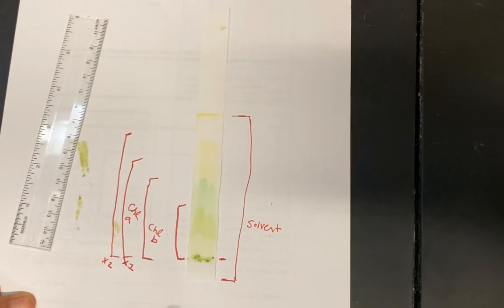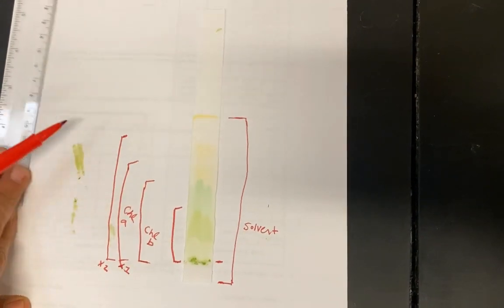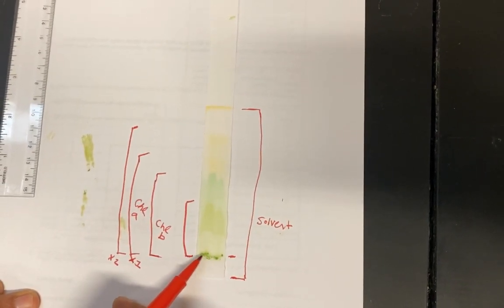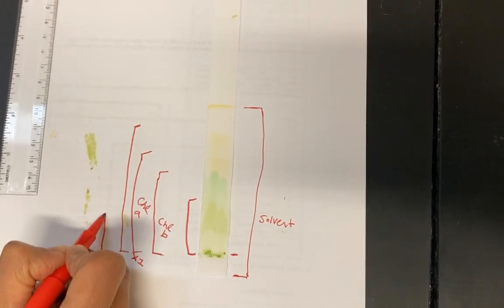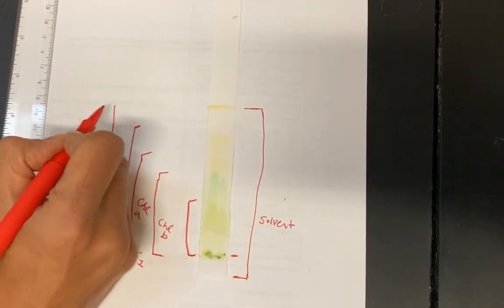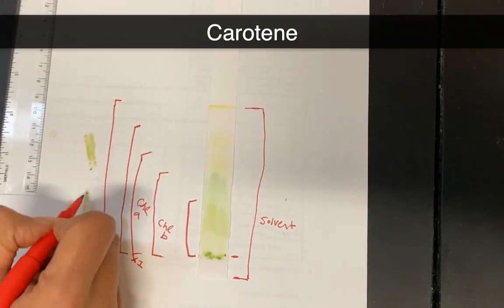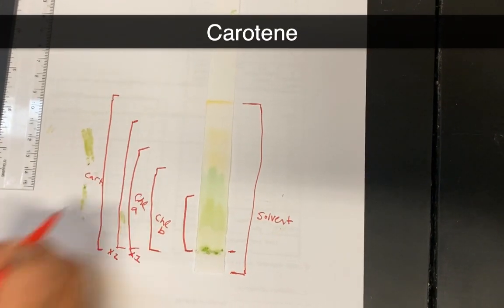And then the last one is the carotene that goes all the way up. Now, remember, it's not the same as the solvent. The solvent started from the bottom, but the carotene started from where we put it, right? So we're going to go from here all the way up to there. Okay, so this is my carotene.